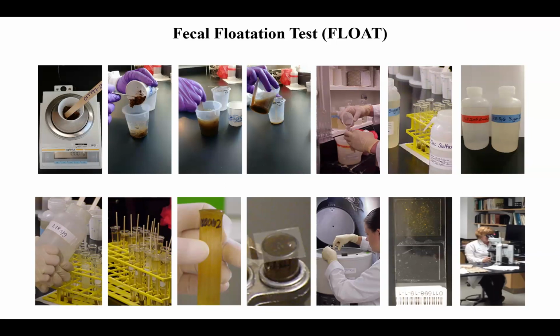So if you have a 12 cc syringe that you use to give shots and stuff, if you were to fill that 12 cc syringe with manure, that would easily be your 10 gram sample.